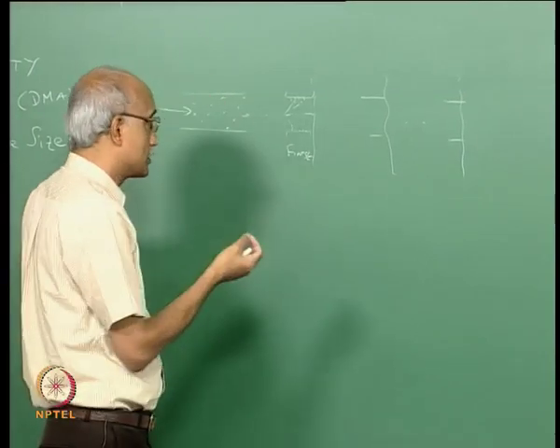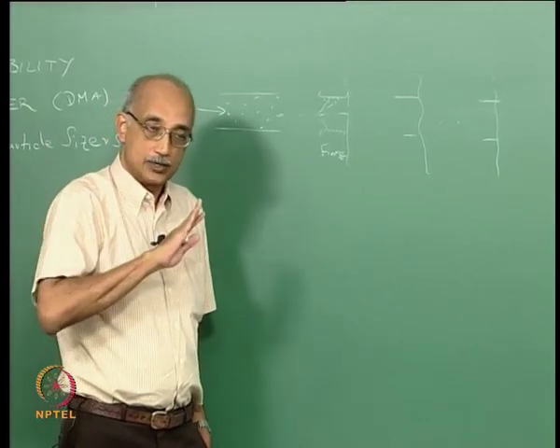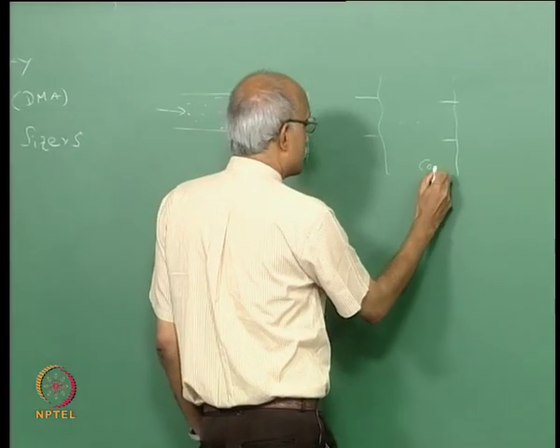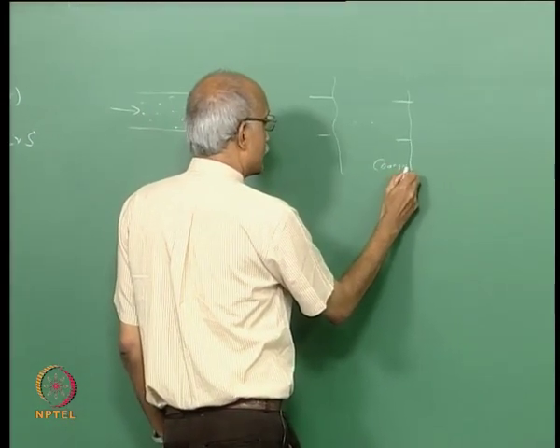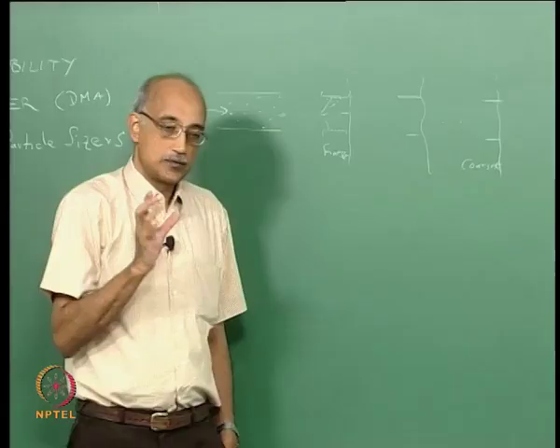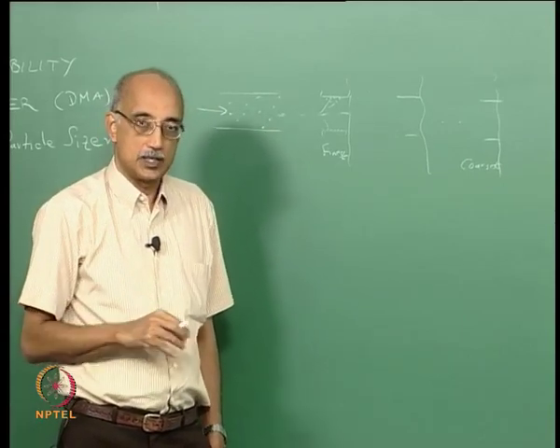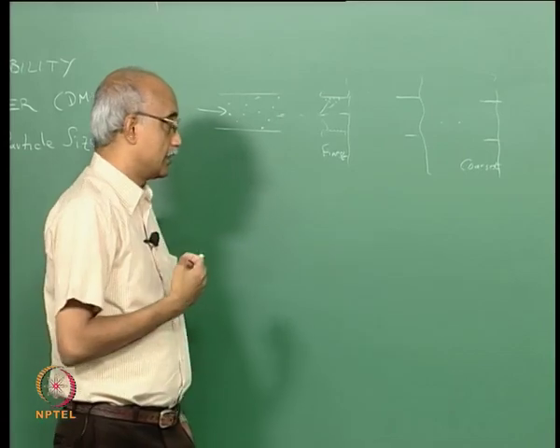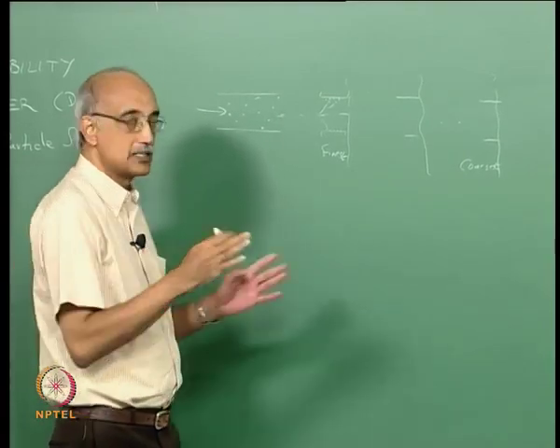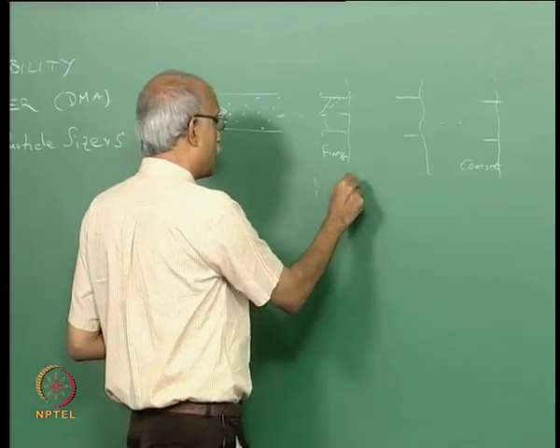The coarsest particles will have the smallest diffusion velocities, and they are most likely to follow the streamlines of flow. So essentially, if you look at this last screen in this diffusion cell or diffusion battery, it will have a predominance of the coarsest particles in the fine particle size range, and therefore it will get captured in the last screen. So what you have effectively done is a classification by size, and there will be an enrichment of particles.